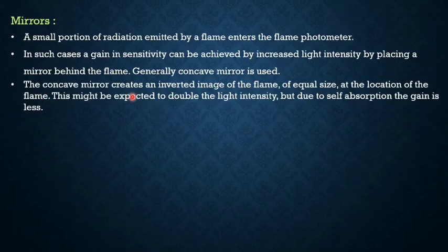The concave mirror creates an inverted image of the flame, of equal size, at the location of the flame. This might be expected to double the light intensity, but due to self-absorption, the gain is less. But there is some increase in the sensitivity.